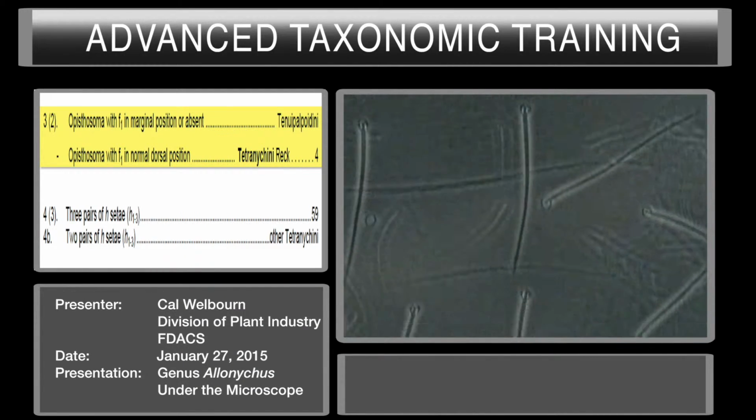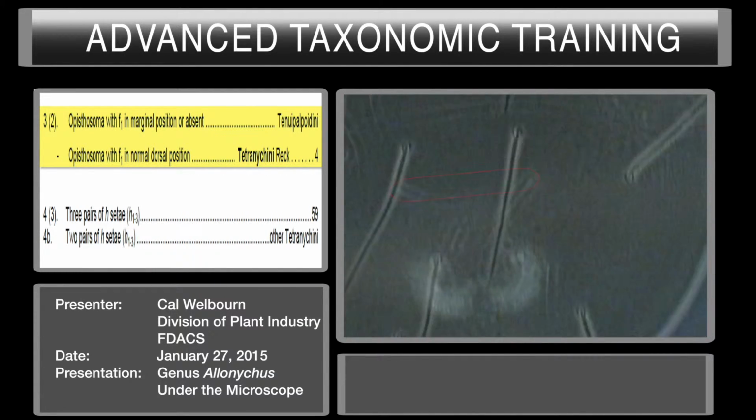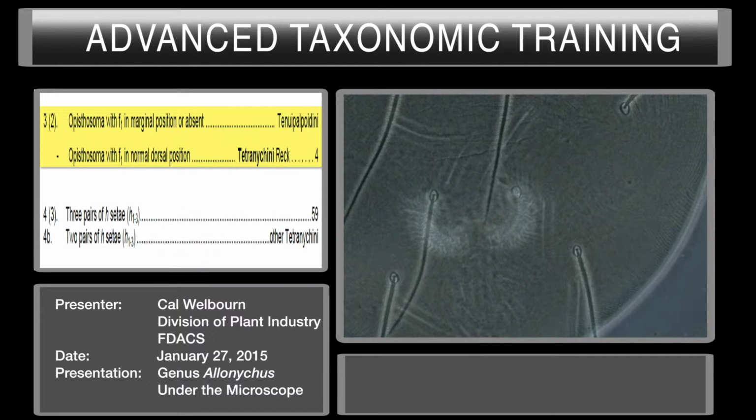C, D, E, F. Whereas, if you notice, C, D, F are mostly aligned. That's the normal position. If they were not aligned, these FCD would be, F1 would be out here somewhere or absent. This is F2. So it's normal position.